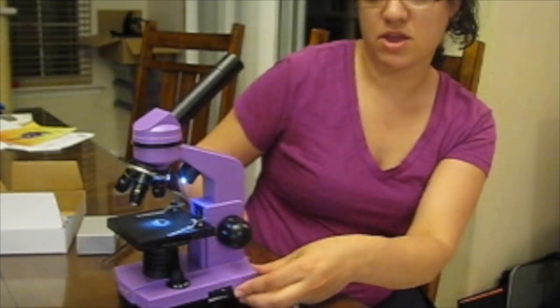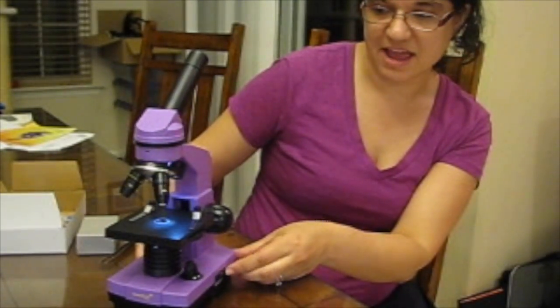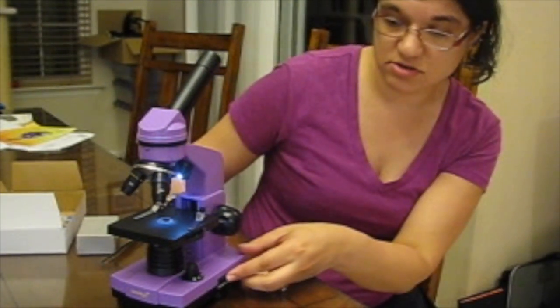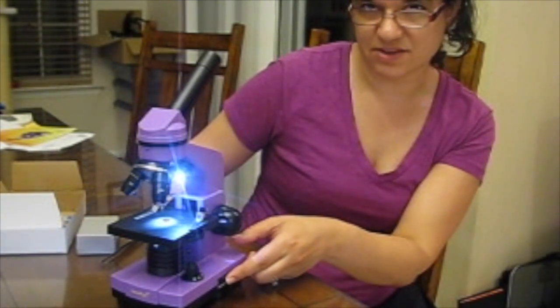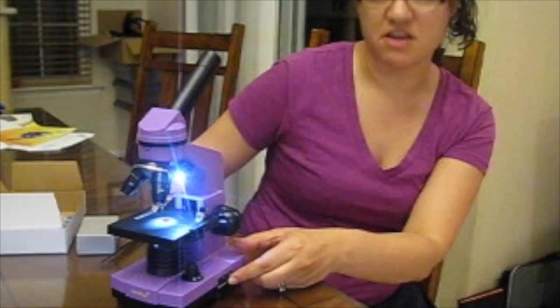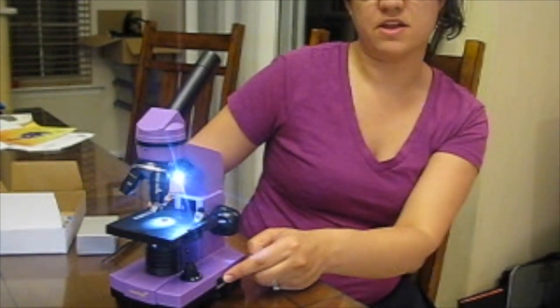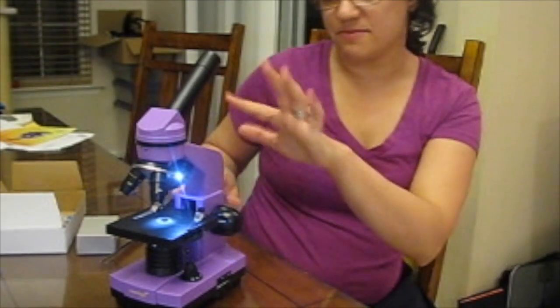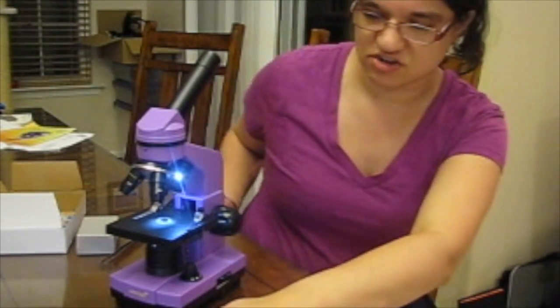There's also a wheel over here that I can use to dial in the intensity of the lower light source. You can definitely see on the video that as I dial it up, that light gets brighter. And that's actually really nice. I find that as you change the magnification level, sometimes you want to change the brightness to keep things clear. So that's nice.